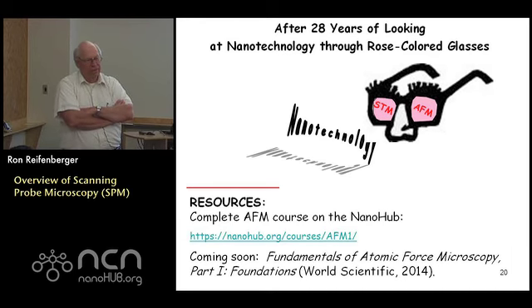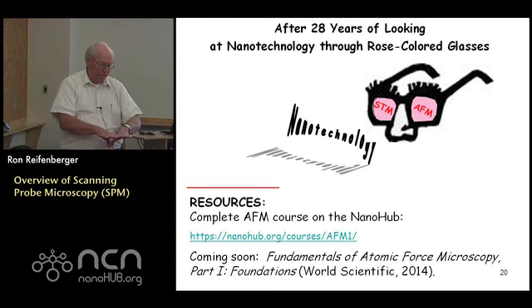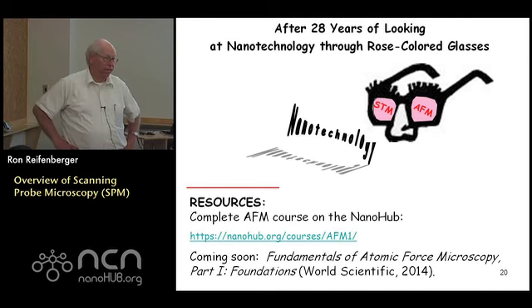The scanning electron microscopes tend to be much easier to use. So if you're just trying to get a very quick image of, let's say, a silicon wafer that's got trenches in it, and you just want to measure the width of the trench, usually it's much easier to do that with an SEM than it is with an AFM.